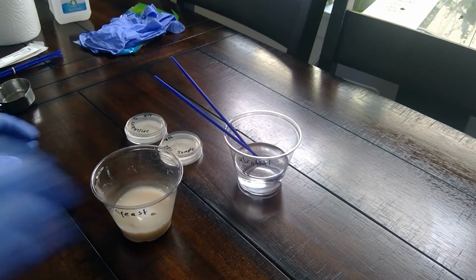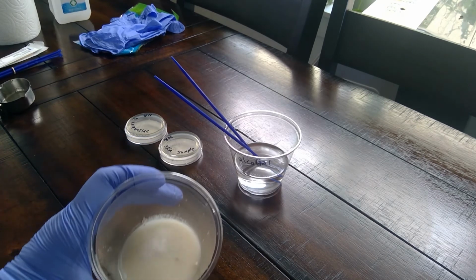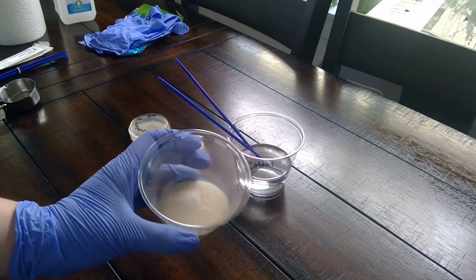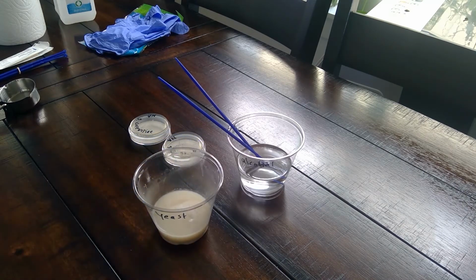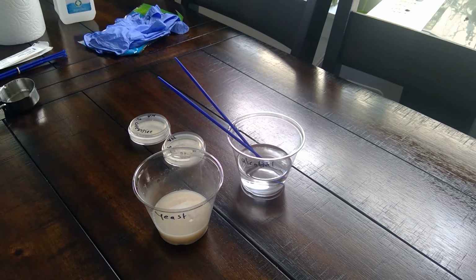And now we'll just let the yeast do its job and wait about 10 minutes until it's frothy. And you can already see some start, but I'll be back in about 10 minutes. All right, it's been about 10 minutes and this is how my yeast looks now. It's not super frothy like the picture. Oh, you can't really see that, but this is just from the website.